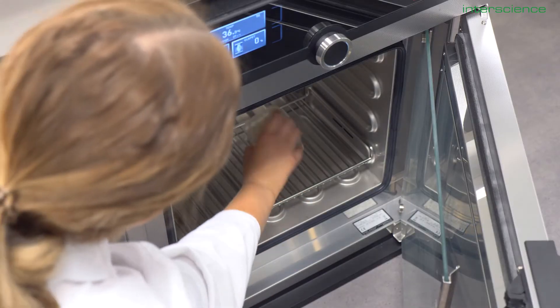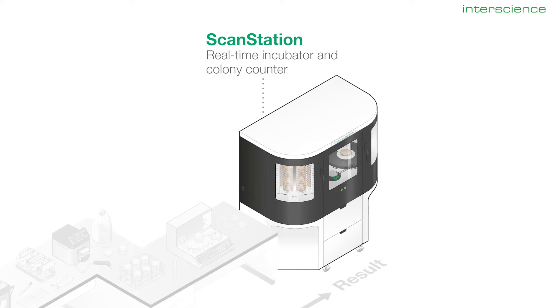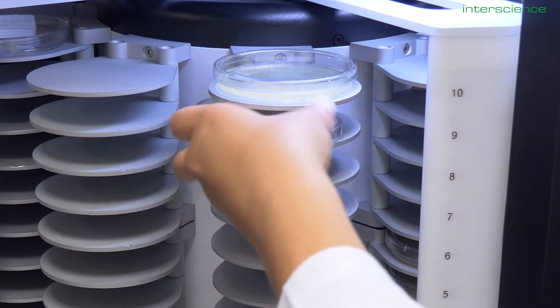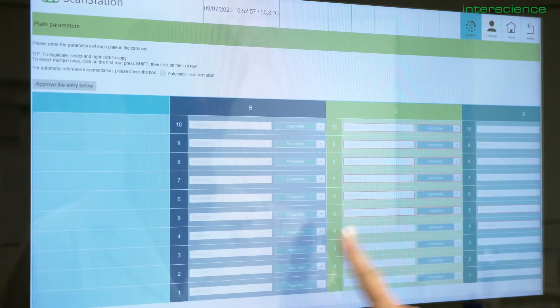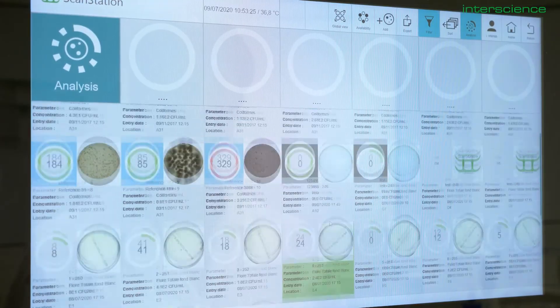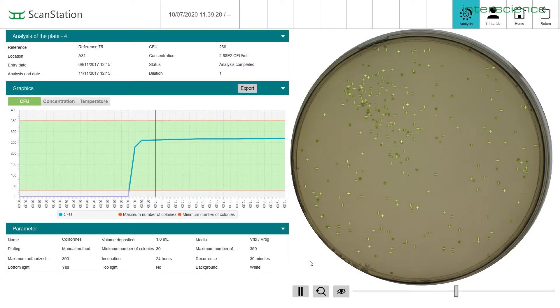Now that we have plated all of our samples, the last step is to incubate before counting later on. You can choose to place the samples directly in the ScanStation or in a regular incubator. You can load the plates in one of our ScanStation smart incubators. Manon can place all her plates right side up or upside down, and she can use any plate format smaller than 100 mm in diameter. Manon can place multiple batches at different times inside the same chamber, assign different reading parameters to each batch, and program changes in the incubation temperature. When the reading cycle starts, the robotic arm will grab each plate and take a picture every 30 or 60 minutes, creating a movie so that you can visualize the bacterial growth in real time.